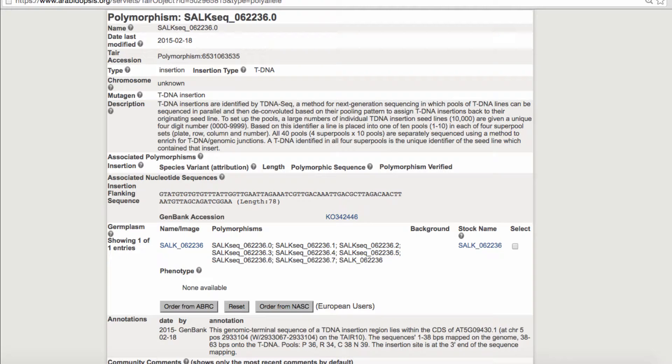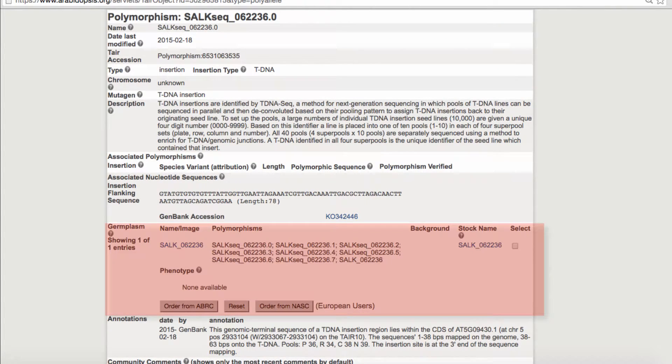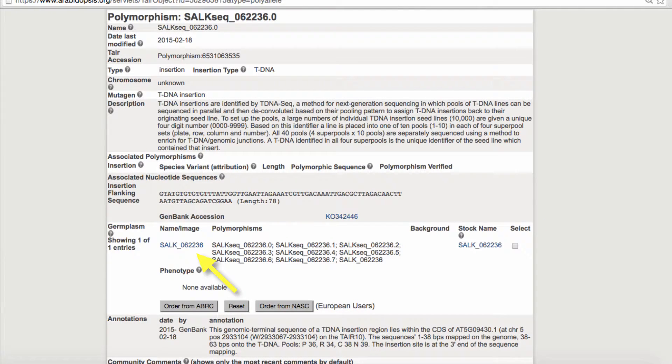Be aware, though, that TAIR will be updating and integrating all the new mapping data along with the Araport 11 genome release. Now scroll to the germplasm section to find the stocks that contain this insertion. In this case, there's a single stock available.